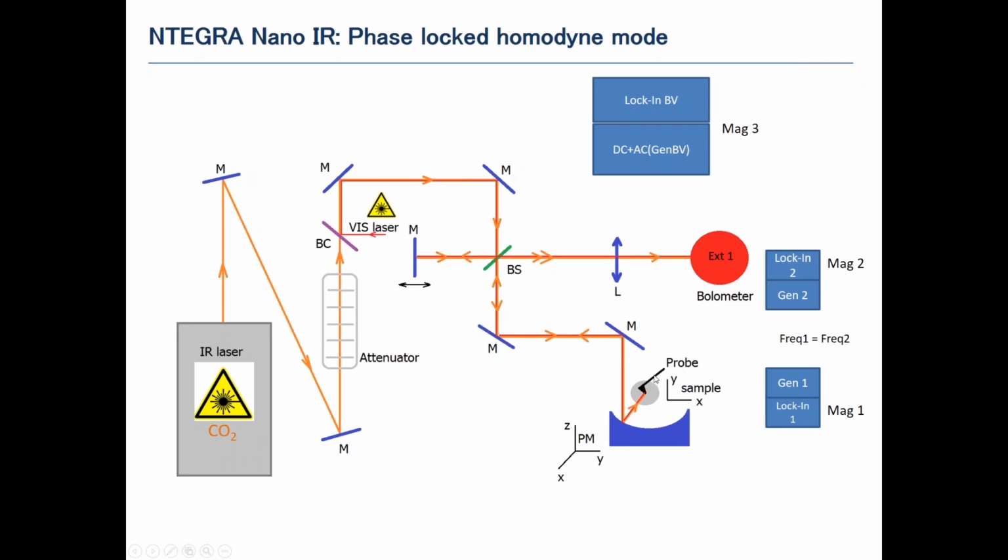The probe oscillates on its resonant frequency, and there is a first feedback system that, as in the usual tapping mode or semi-contact mode of AFM, just holds the amplitude of the probe oscillation constant, and this is just a regular tapping or semi-contact regime.